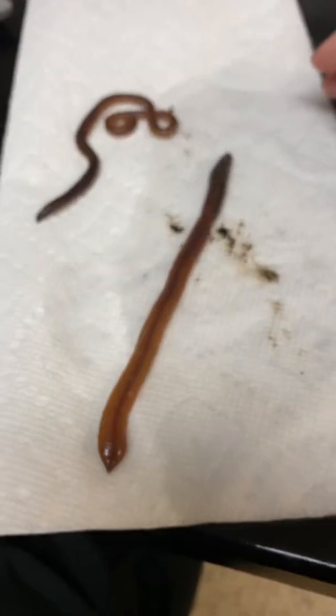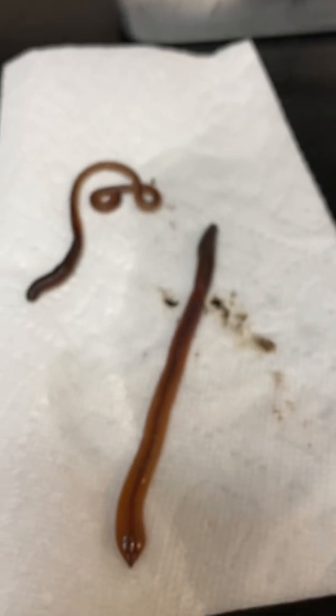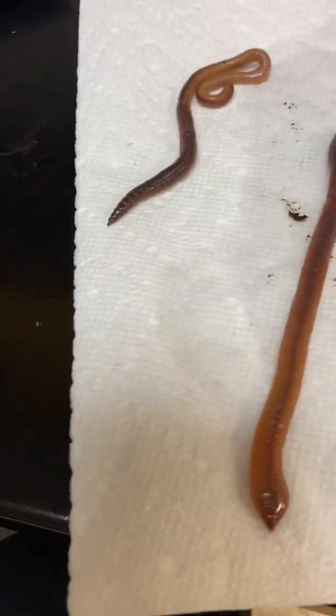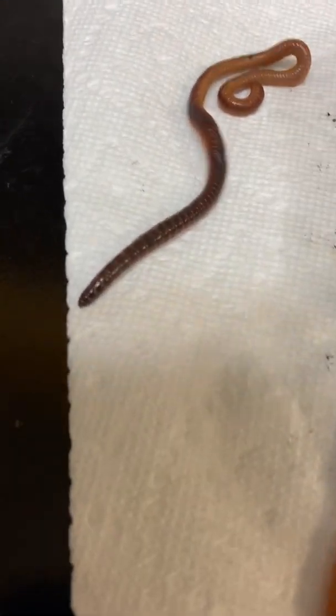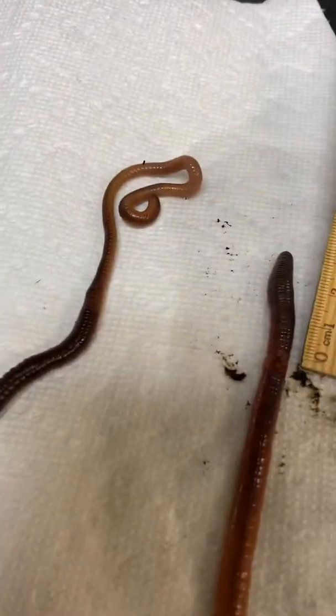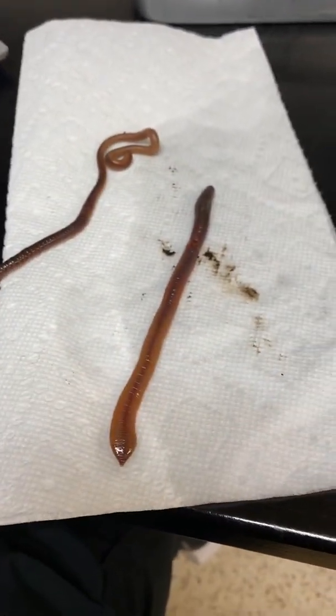And that's only like a third, a fourth of the worm. So that's 32 segments, so times it by about 4.